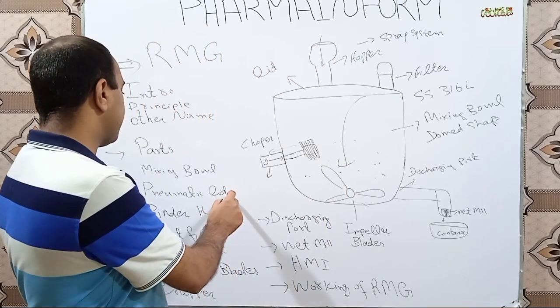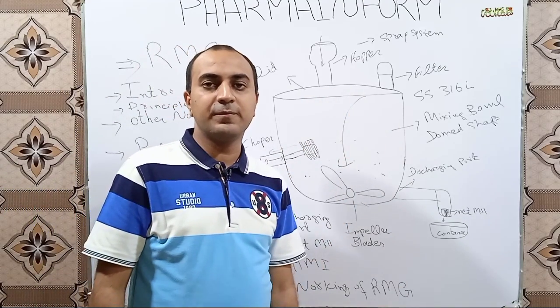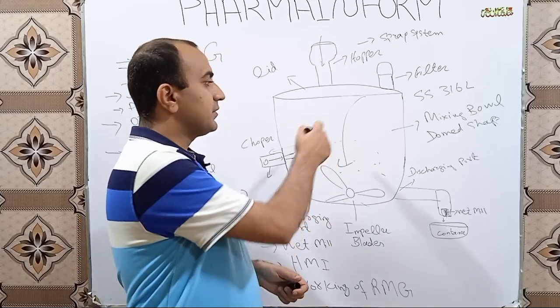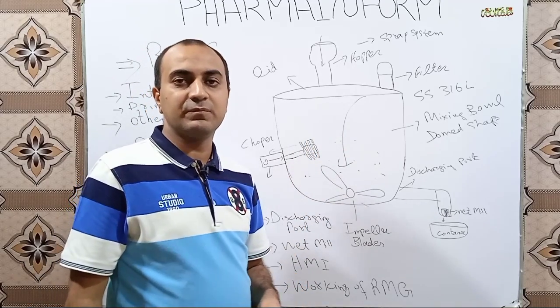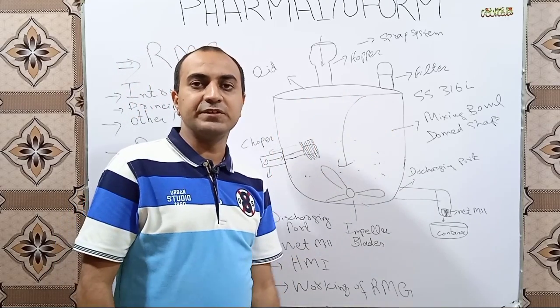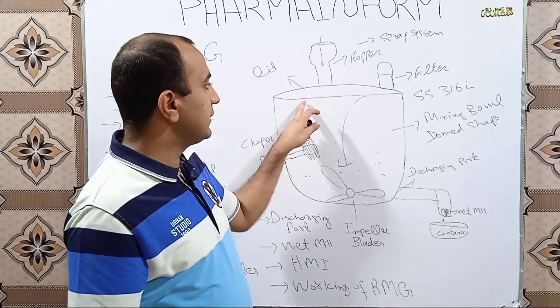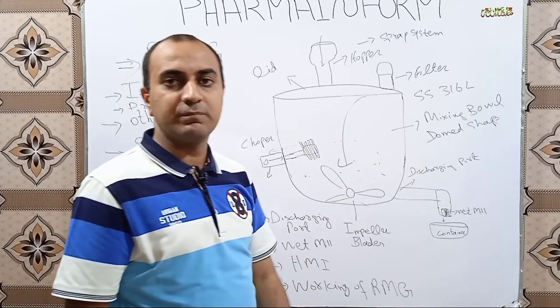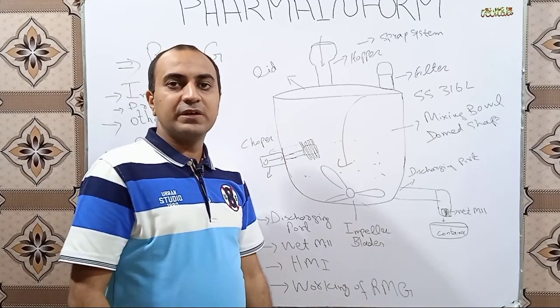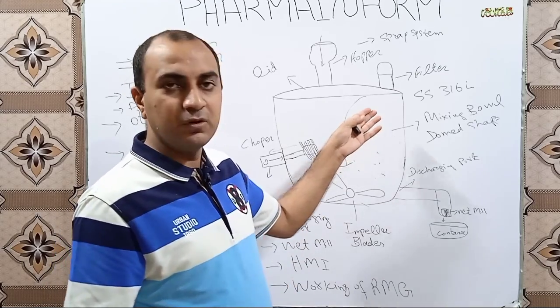The next part is the pneumatic lid. The mixing bowl is covered by a lid which is driven by air pressure — it has a pneumatic air-driven lid. After adding the material into the mixing bowl, we seal the lid through the pneumatic seal system, so the lid is tightly closed over the mixing bowl and leakage of powder during mixing is prevented. We only press an open or close button to operate the lid.